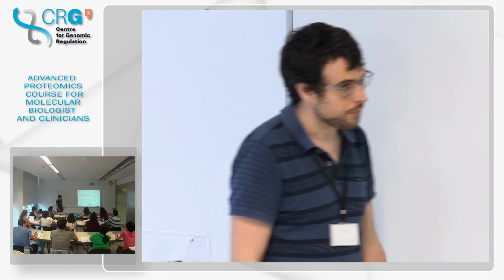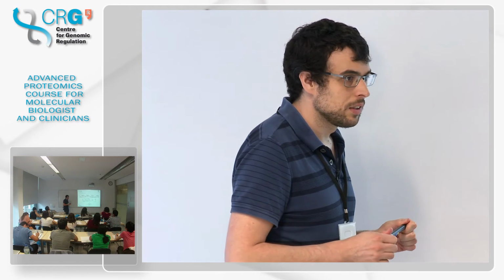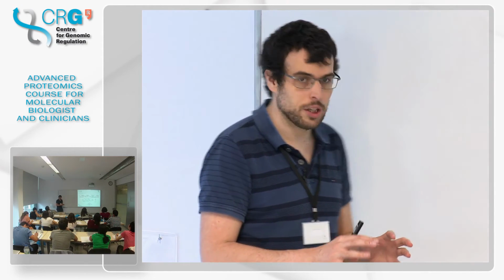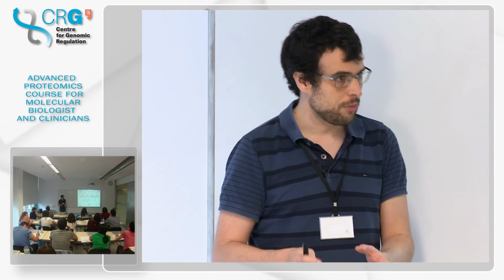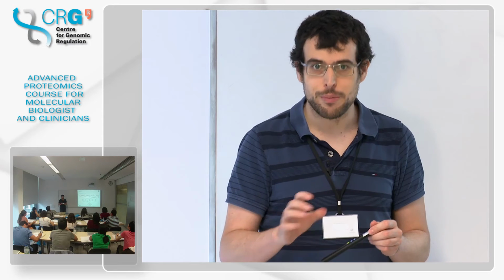Sorry, but the MS1 is a protein or a peptide that is fragmented into small peptides? So here in MS1, in this case we are always working with peptides. Okay, so I introduced, this might not be clear, I introduced before top-down and shotgun proteomics. We will be working during the whole course mainly with bottom-up proteomics.